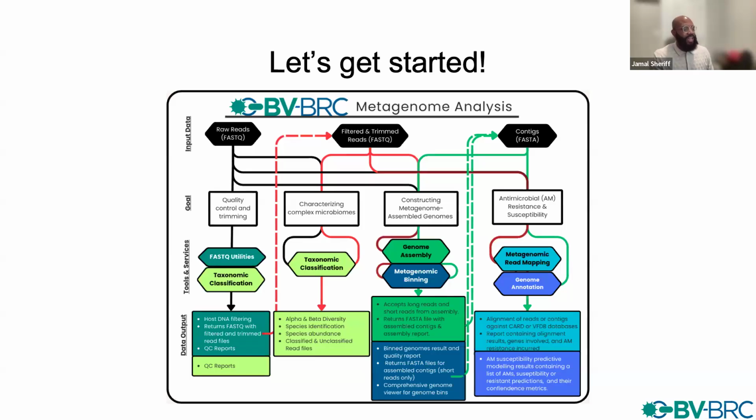We also have a predictive model within our genome annotation service that can provide predictions for antibiotic resistance or susceptibility of your isolate. This is in the handout, and we'll go over it when we get there. There's a list of genera that are included within this model.